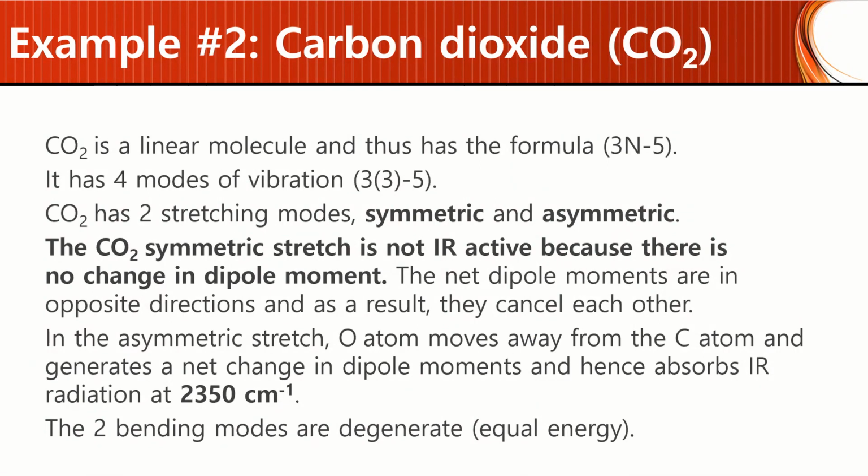All right, so let's look at example number 2, carbon dioxide. Carbon dioxide is a linear molecule, unlike water, and thus has the formula 3n minus 5. It has 4 modes of vibration. If we do the calculation, 3 times 3 gives us 9, minus 5 gives us 4. 2 of those are stretching modes, symmetric and asymmetric.